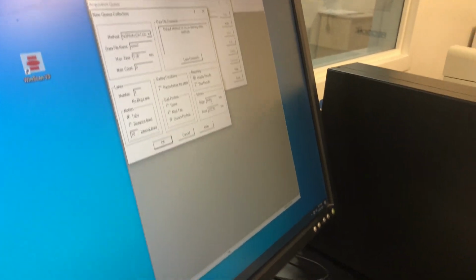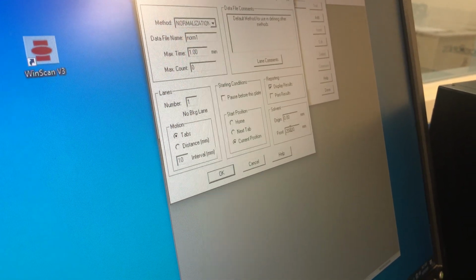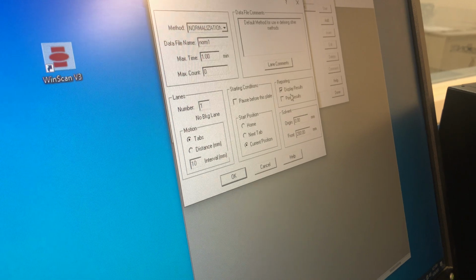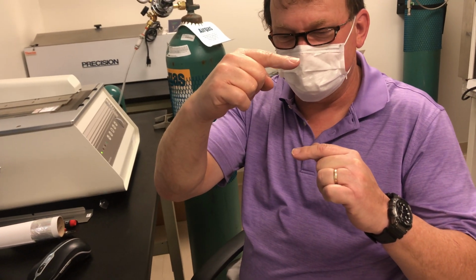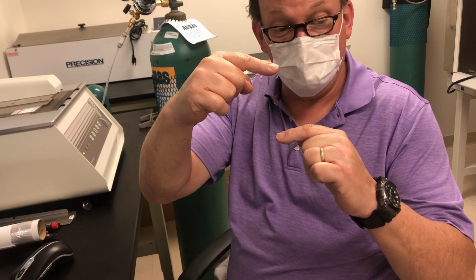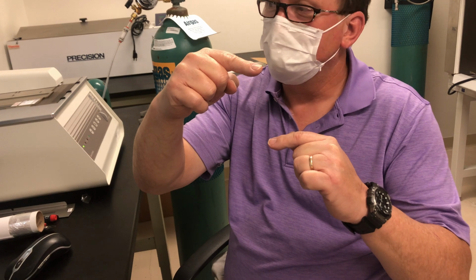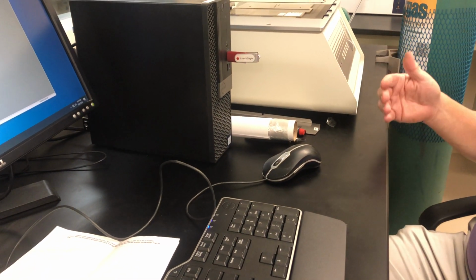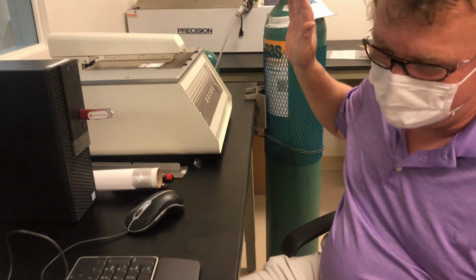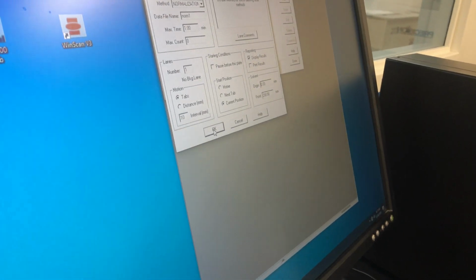Okay, origin and front. Right. For this, it doesn't matter. It's wide open from 0 to 200. So the origin and front, that's when you're doing your solvent, your TLC plate. Say most people typically use 100 millimeter plates, okay, and they'll put their spot, the origin, at 10 millimeters, and then they let the solvent run up to 90 millimeters. That's very common. So there you would have origin of 10. Well, it depends on where you set the plate, okay? So we'll get into that in a little bit. Right now we've got to do this normalization. Sorry. Yeah, we'll set up a realistic method right now.